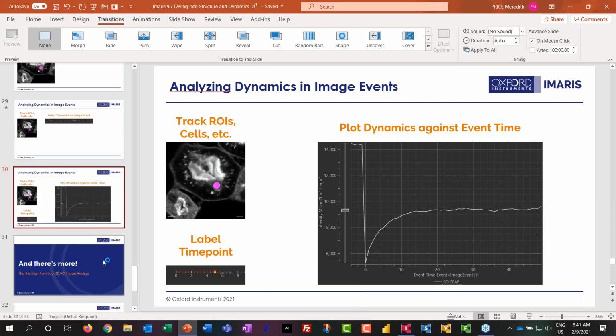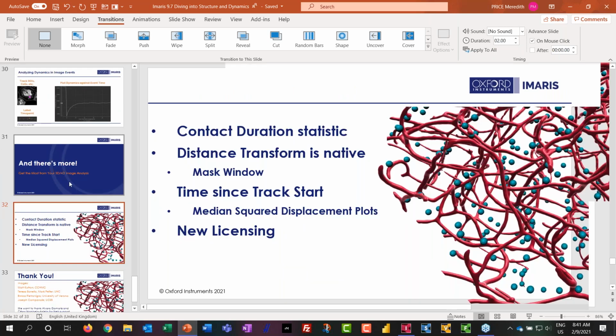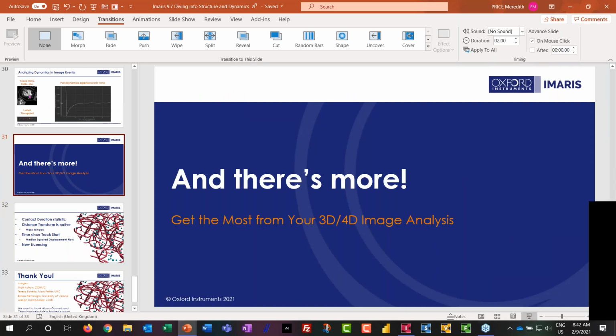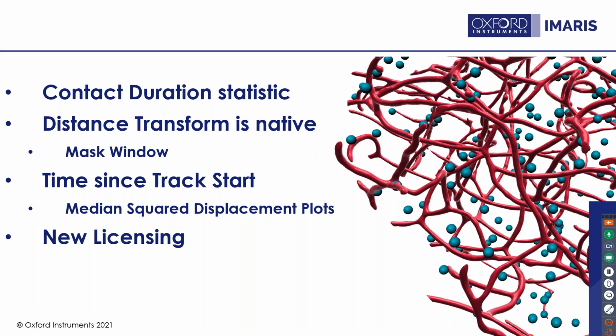Okay, what I'm going to do in the meantime, since I can hear all of my hard drives booting up in the background and Imaris wants to connect to all of them first, is I'm going to go through and just tell you the other features, and then I'll go back to the event stuff to show you inside of Imaris. So we do have some more things.